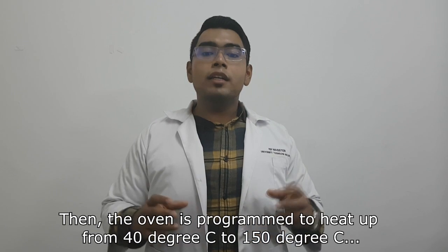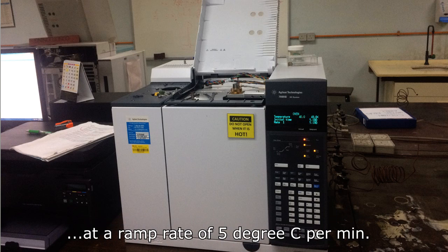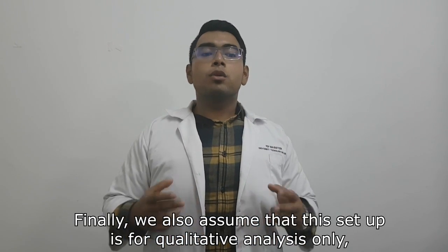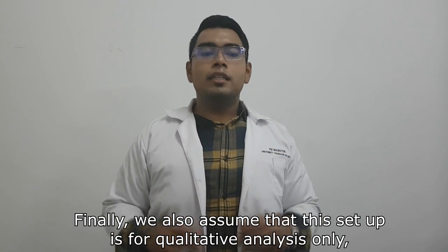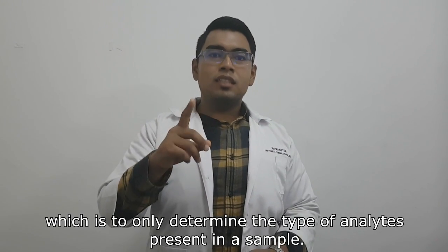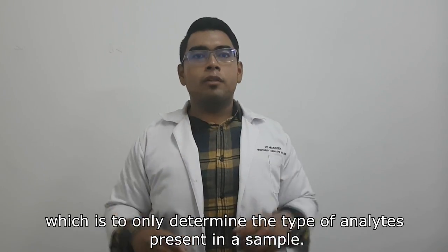Then, the oven is programmed to heat up from 40 degrees to 150 degrees at a ramp rate of 5 degrees per minute. This programmed temperature heating procedure is done to speed up the elution process, thus saving time. Finally, we also assume that this setup is for qualitative analysis only, which is to only determine the type of analytes present in the sample.